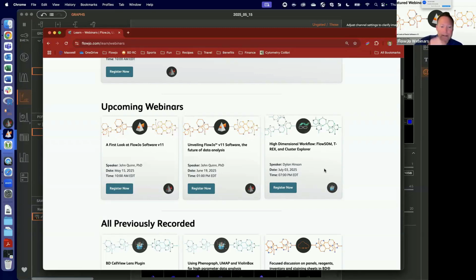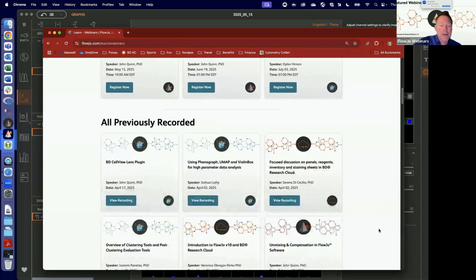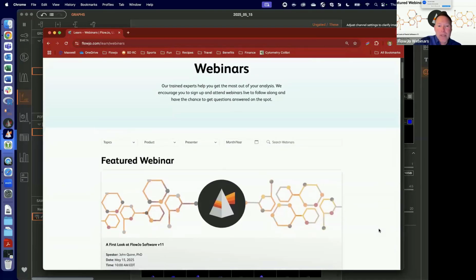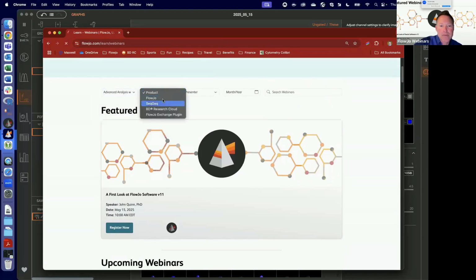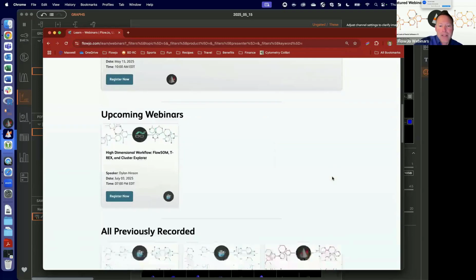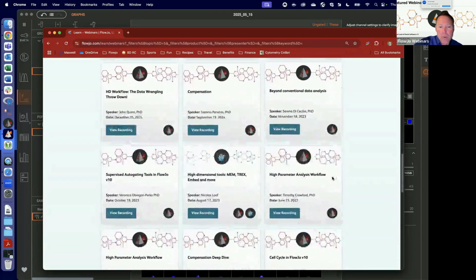Yes, Gina, there are webinars for everything. There are short videos for Flow AI, particularly on the documentation page, and somewhere within our webinars, probably advanced analysis with FlowJo, we did a whole suite of all the QC tools in one webinar.